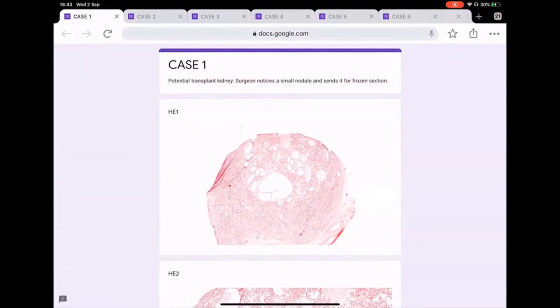So this leads us to another scenario for the deferral. They might tell you, okay, so what do you want me to do? Don't forget you are talking to the surgeon, you're not talking to a pathologist. So you say, it's not up to me to decide for you what to do. However, I may do some extra levels. I might see some more infiltrative neoplastic glands if you wish to wait. The other thing is, if you feel that you have a definite tumor, then you can send me more material, you see, which is a real scenario.